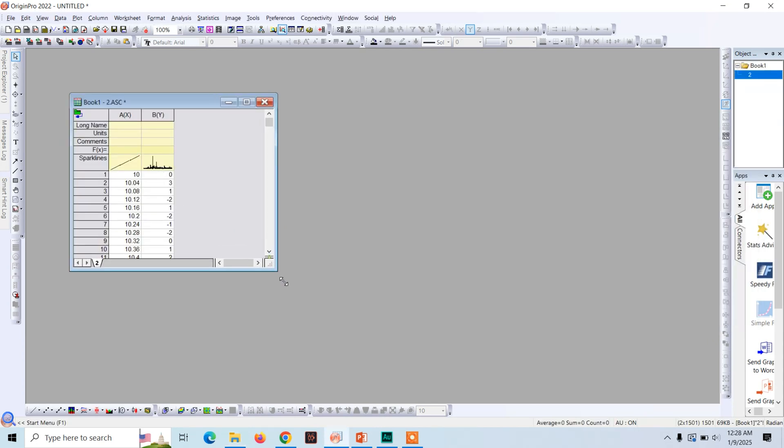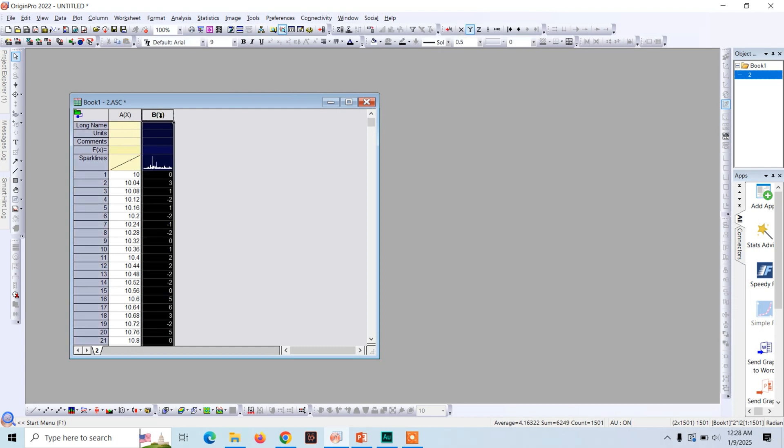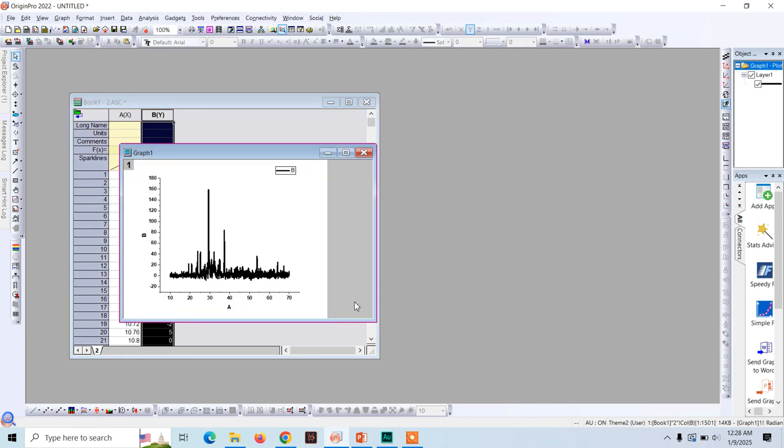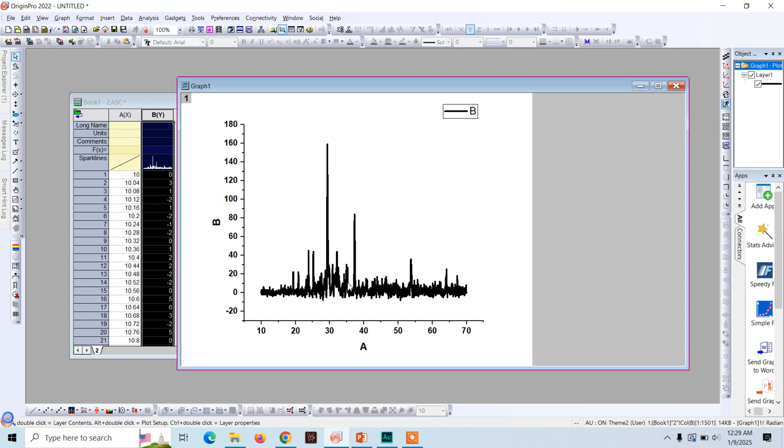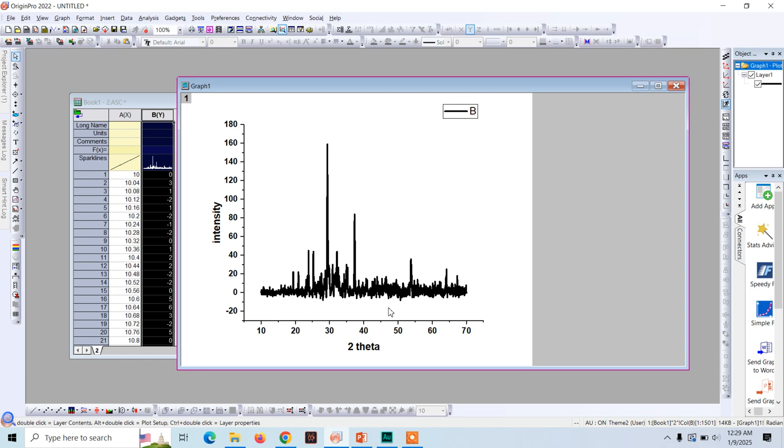Now we are going to plot this data in Origin. Just open Origin and drag and drop it here. It will open this window. Now select this and click on plot. This is the XRD graph. On the x-axis we have two theta while on the y-axis or the vertical axis we have intensity or counts.